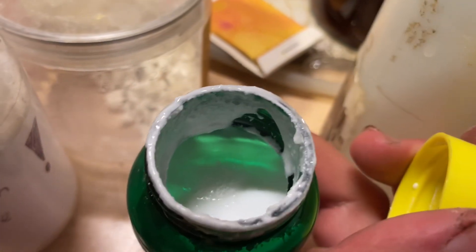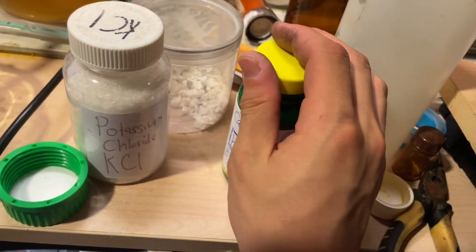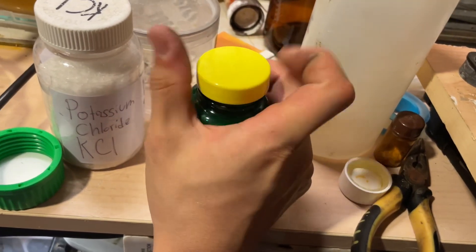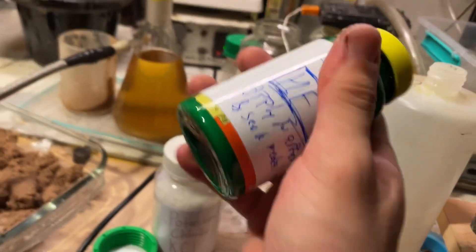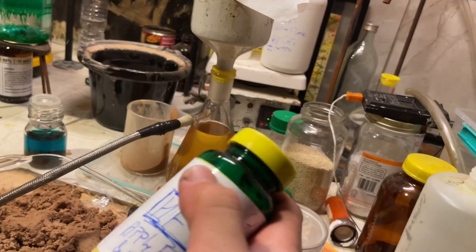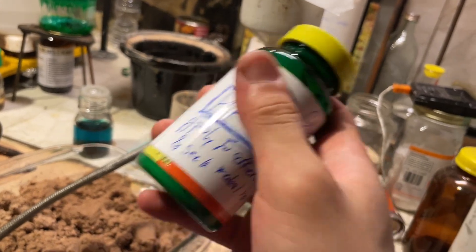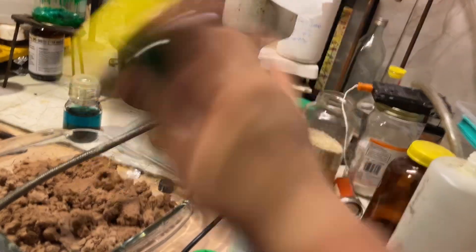I also threw in a little sodium benzoate, didn't bother measuring it because it doesn't really matter, as a preservative to stop it from growing bacteria or mold. Mold can grow in copper acetate, so mold will grow on anything it can. Might as well just prevent that.